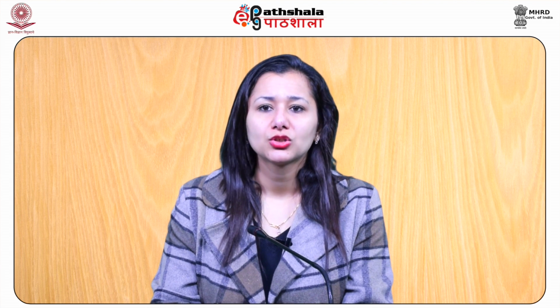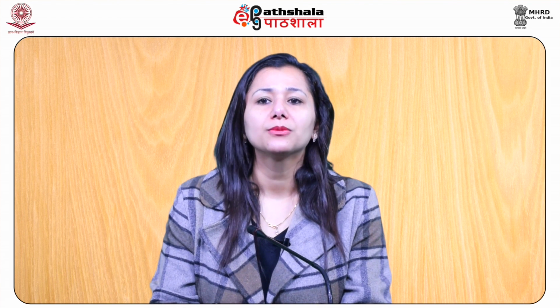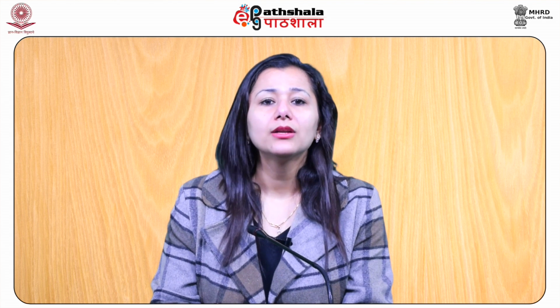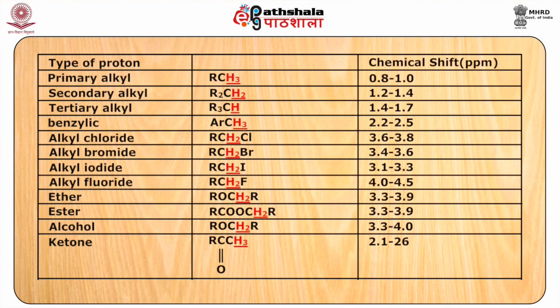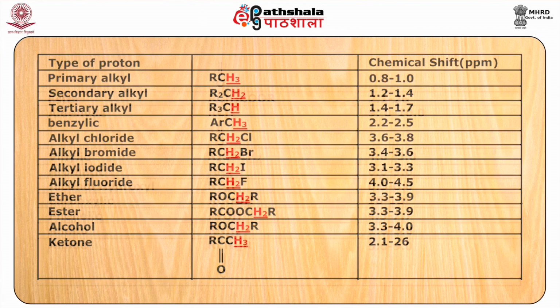While solving structure for the Proton NMR, it is important to write down the chemical shift, integration and the split of each peak. Then, based on the chemical shift of the peak, write down the possible functional groups and the structure. Lastly, arrange and connect these structures so that it matches the split and the integration of Proton NMR. Table 1 shows the different types of protons and the chemical shifts.